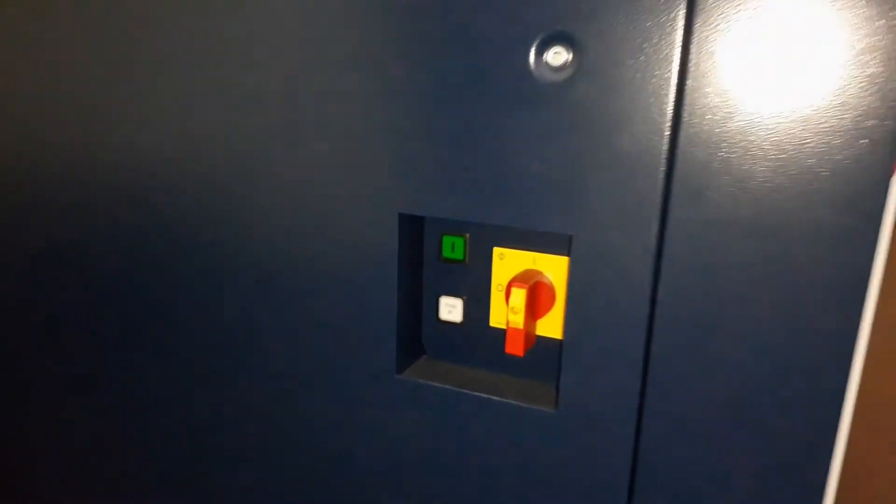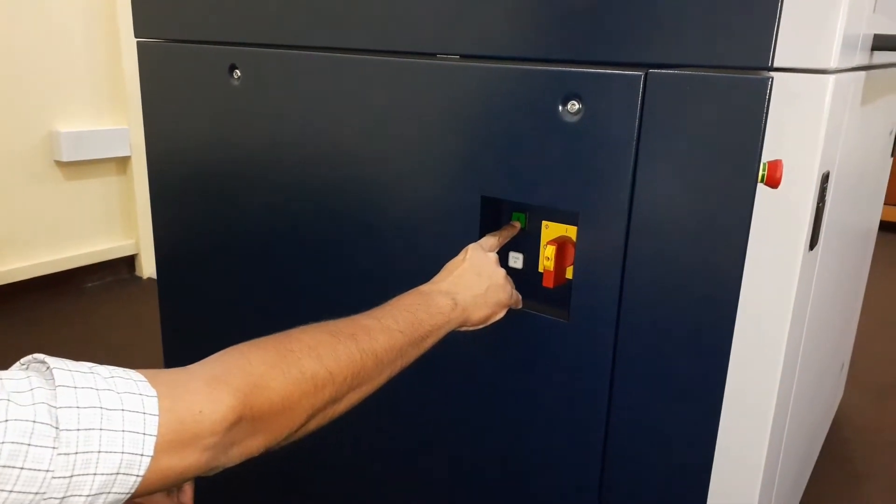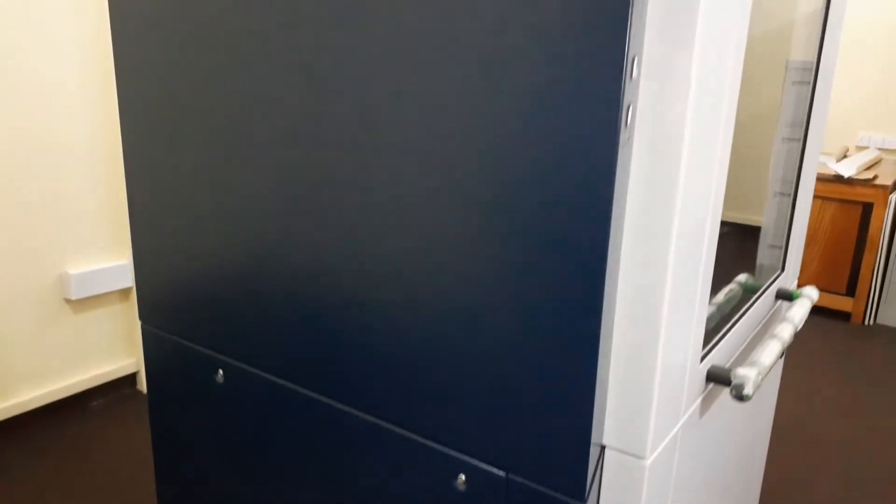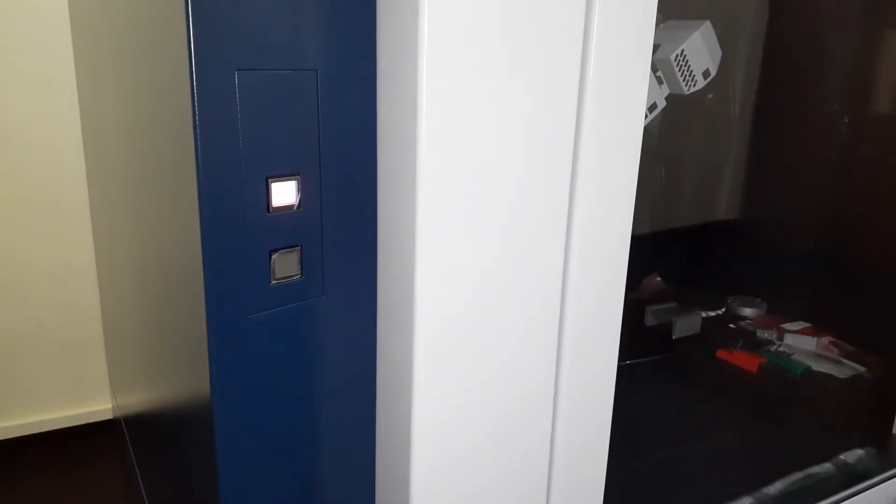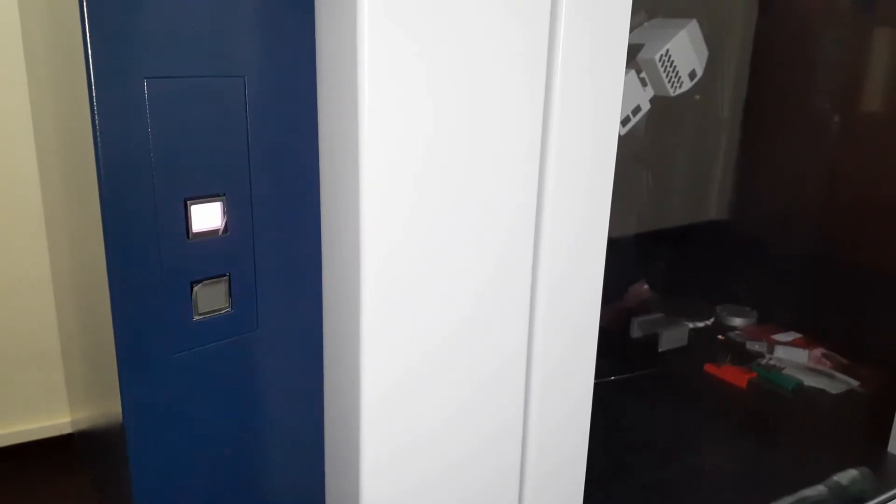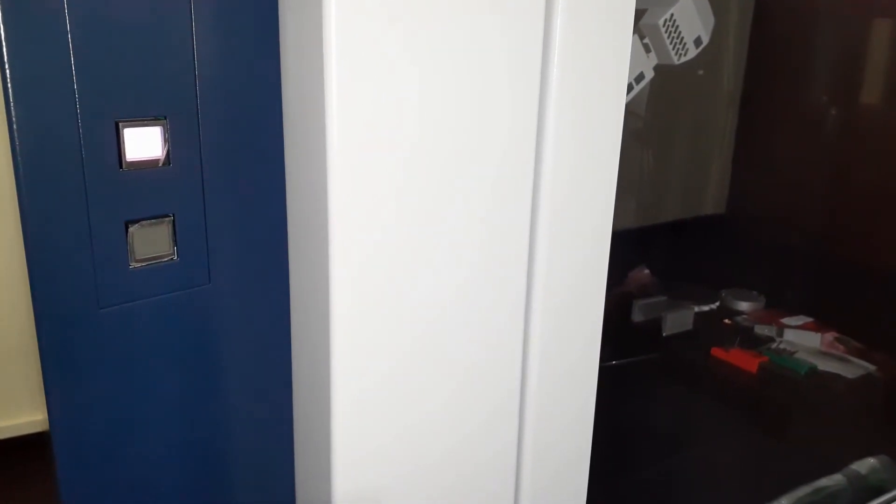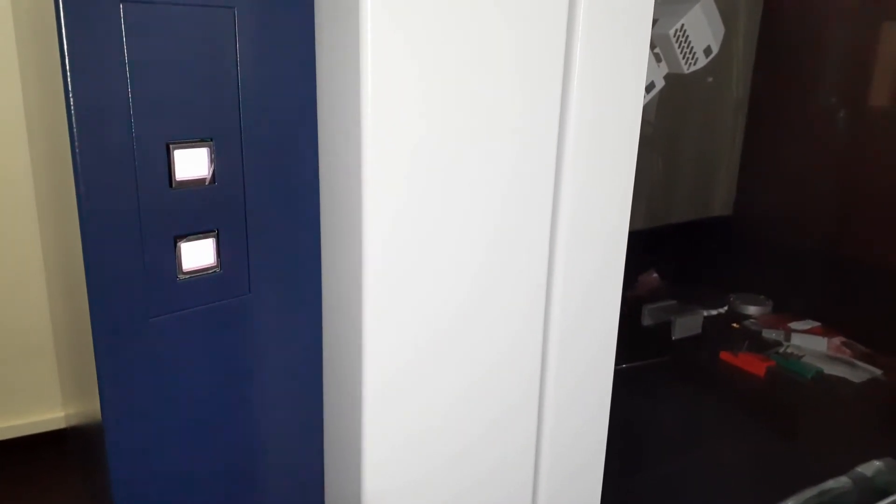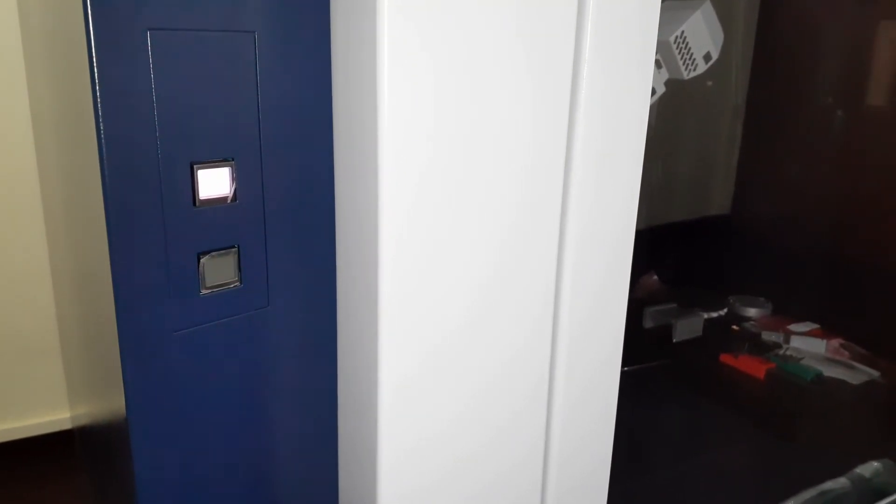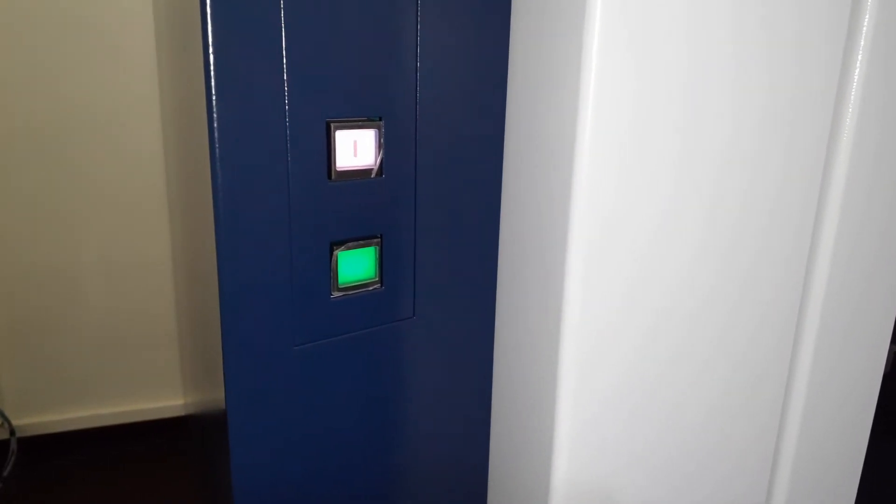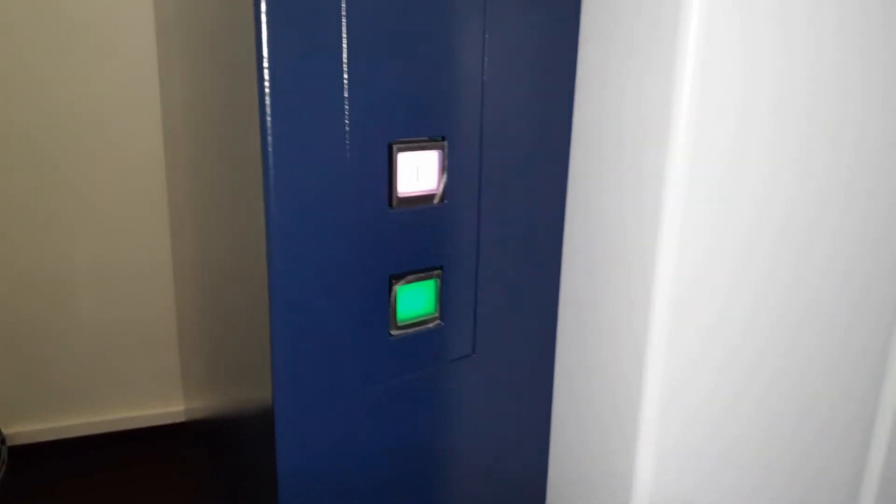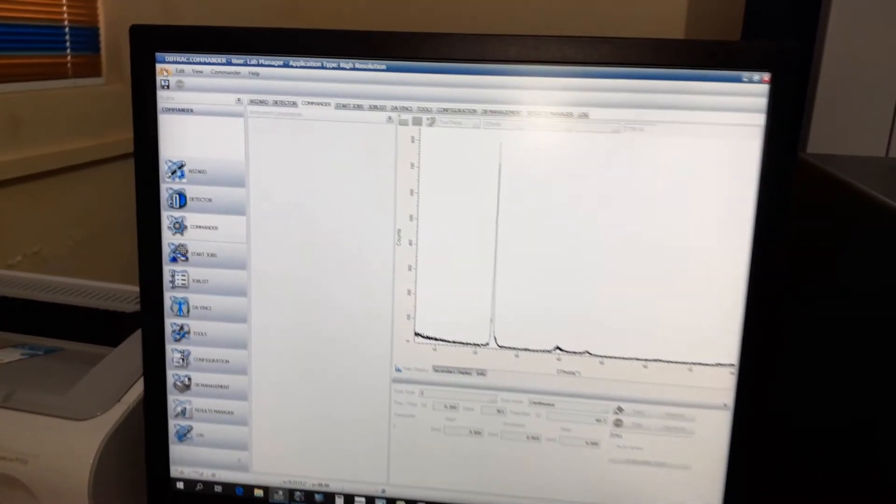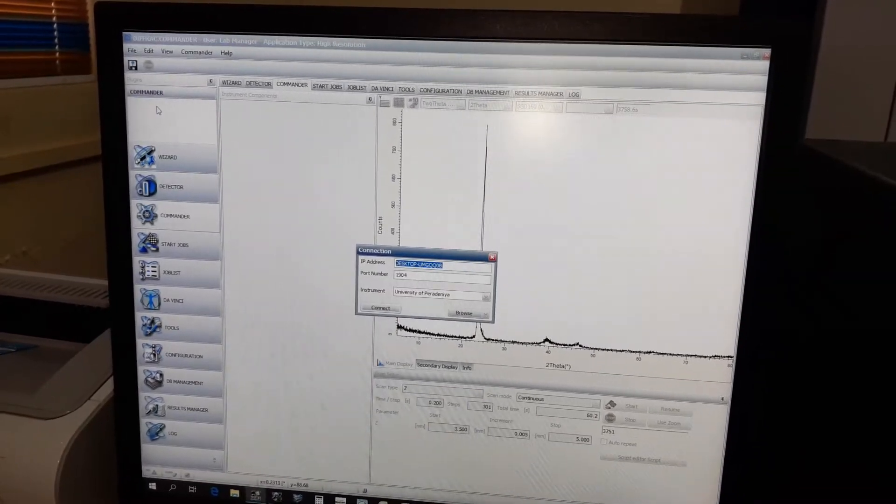Now we can power up the XRD machine. Now we can connect the computer to the XRD machine.